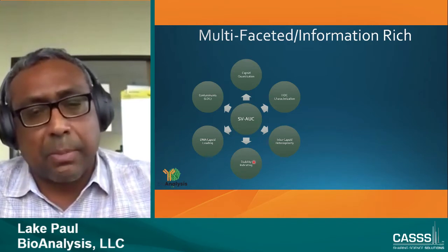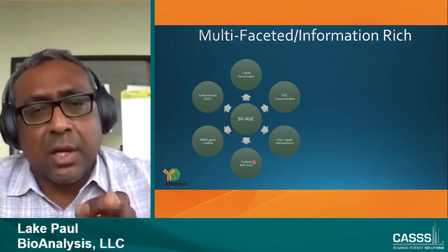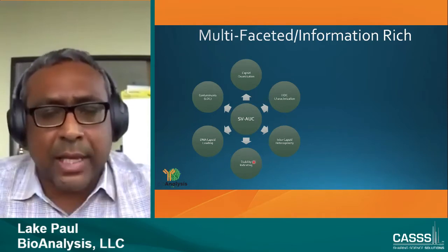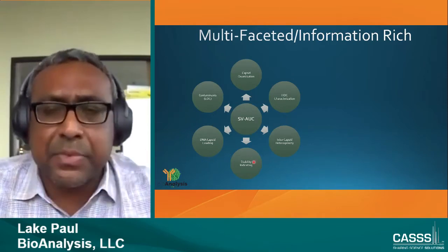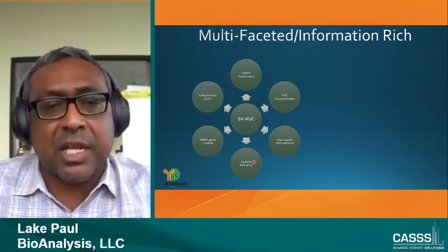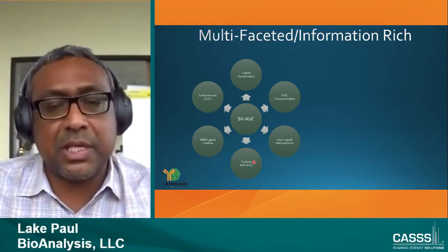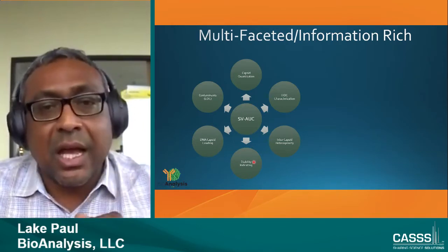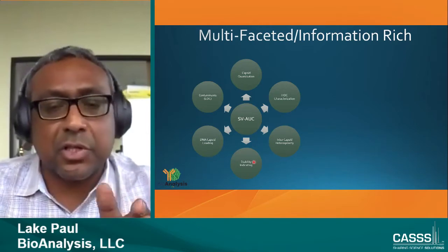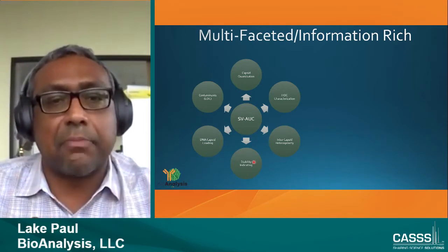I'm talking about what is happening at every capsid. What happens to your partial? What happens to your full? What happens to your empty? What happens to the VP aggregates? You can measure that, and quantitate each individual species in the AUC as a function of temperature and time, and you can get very, very good data.